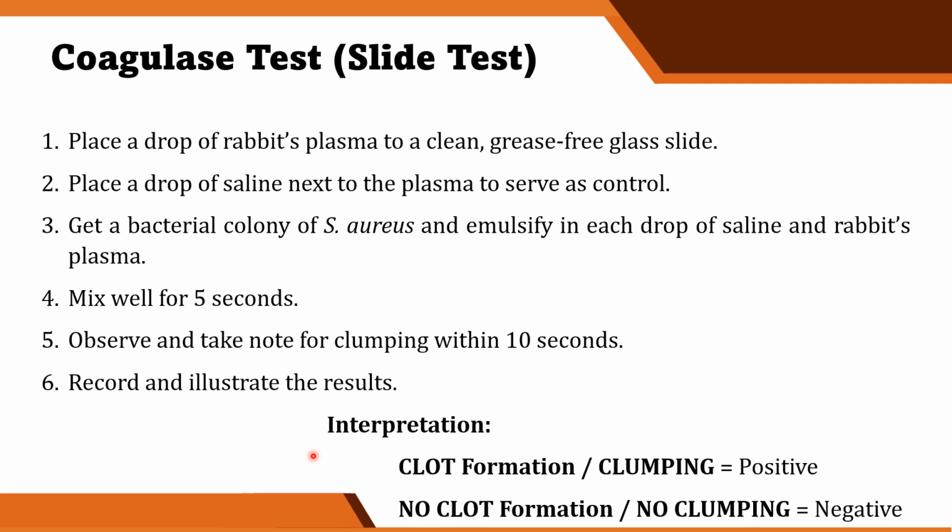Pag nagkaroon ng clot formation or clumping, that is positive for slide coagulase test. And then kapag wala naman, edi negative for slide coagulase test.